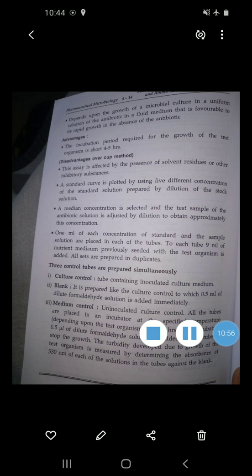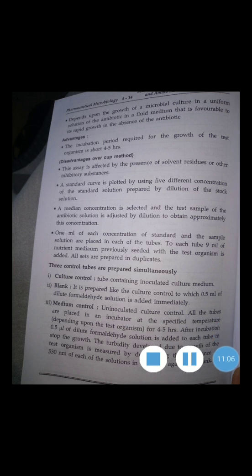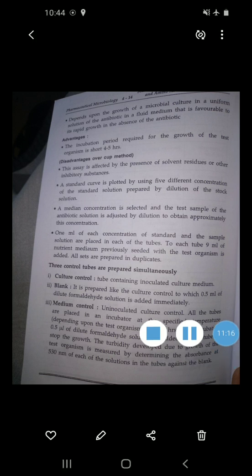Then we will see next the principle and method of assay of amino acid. The turbidimetry method for the assay of amino acid is precise, rapid, and adaptable to a large number of samples, whereas the enzymatic method cannot deal with a large number of samples, and the titrimetric method requires a long culture time, that is 72 hours.